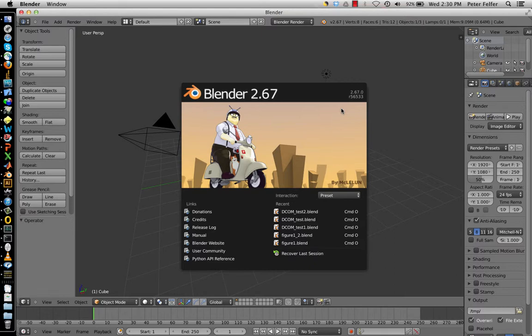And for that purpose, I'm going to use Blender and a custom script in Blender that you can download from a web page. It's very easy to use. If you don't know what Blender is, it's a free and open source 3D program that's very useful for working with 3D data in general. It's obviously made for animation and computer graphics, but it's also very useful for scientific purposes. And because of its animation and rendering background, it's also really great to make nice images of your data. So okay, let's get started then.